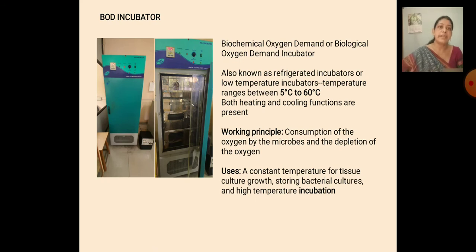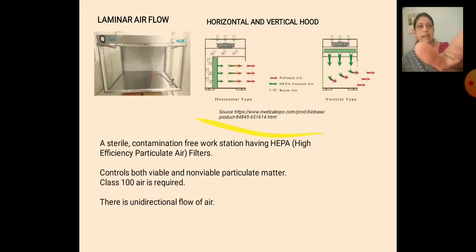Then high temperature incubation can be done, low temperature incubation can be done, and it totally depends upon the oxygen demand of that bacteria. Suppose there is a change in the color of the media or the color of the colony, that means the desired or required species of bacteria has transformed into a separate species. And remember, normally oxygen is required for aerobic bacteria, not anaerobic bacteria.